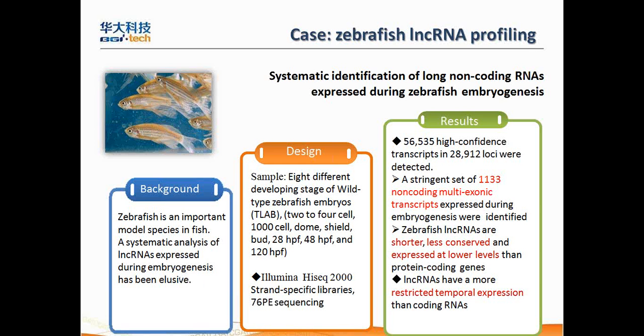They try to detect whether the long non-coding RNA changes its expression during this embryogenesis process. So this is their design of the experiment.